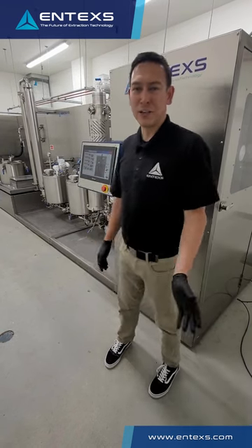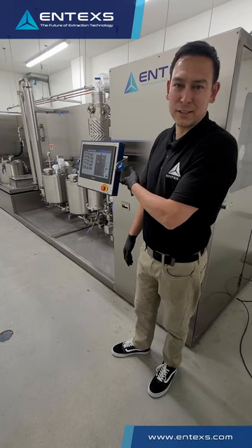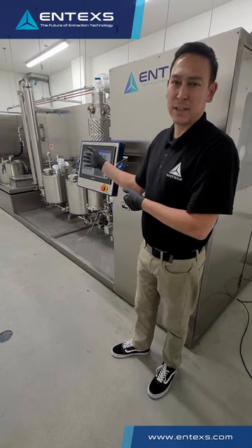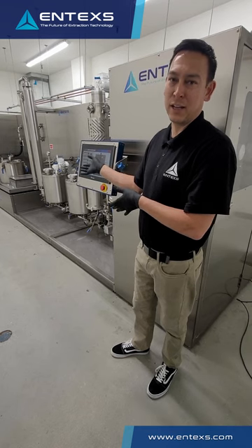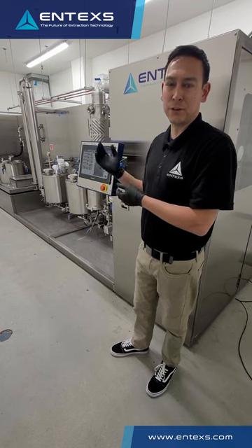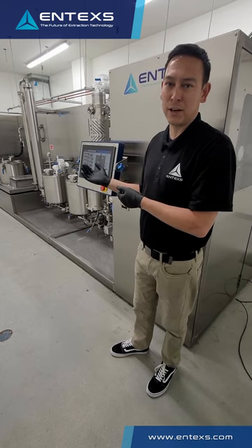Hi, I'm John Davis, CTO of Entex Corporation. I'm excited to showcase our Mini-3 extraction system. This is a full end-to-end solution for cannabis and hemp extractions using cold ethanol, all closed loop, designed and built for EU GMP and GMP pharma grade facilities.